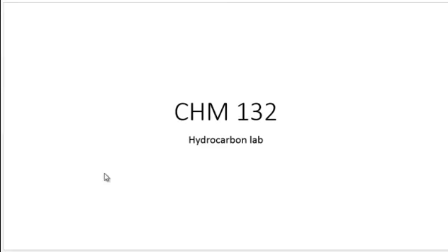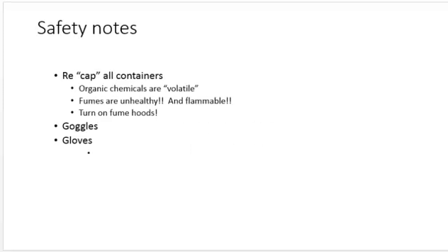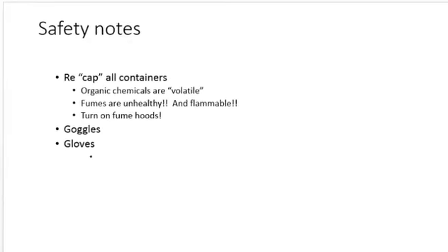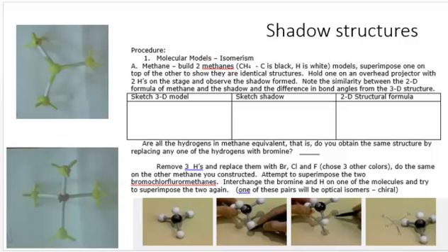Introduction to Hydrocarbons Lab. A couple of safety notes. Make sure that you keep the tops or caps on all the containers because organic chemicals are quite volatile. The fumes are unhealthy and they're flammable, and turn on the fume hoods while you're using them. Use goggles and gloves.